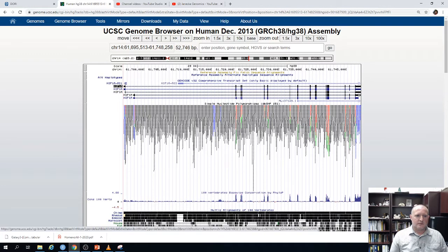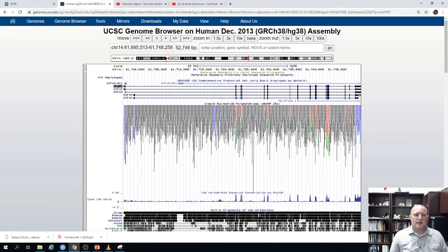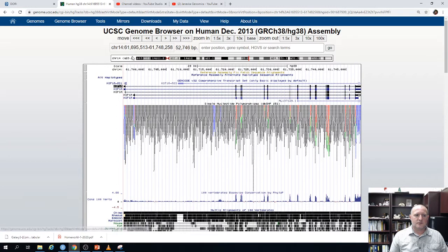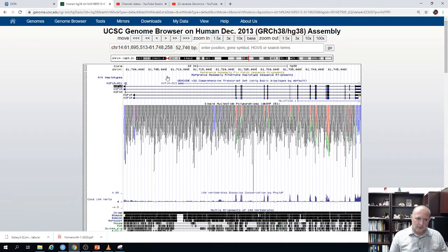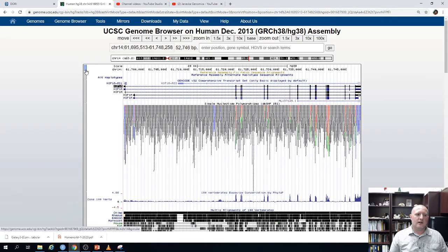This is a picture of the chromosome and its banding pattern. It's divided into quadrants defined by the banding patterns. The centromere is shown with two red triangles pointing at each other. This chromosome has a short arm (the P arm) and a long arm, and a red hatch mark shows where you're specifically looking on the chromosome. Below that we can start seeing the actual browser, which is broken up into different tracks.